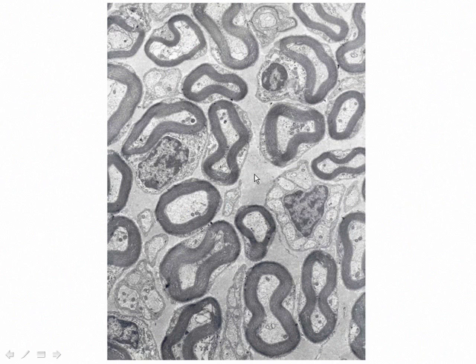And all of the connective tissue in between is called endoneurium. So this is high enough magnification. We do not see the perineurium or the epineurium. All we're looking at are myelinated and unmyelinated axons in cross-section.